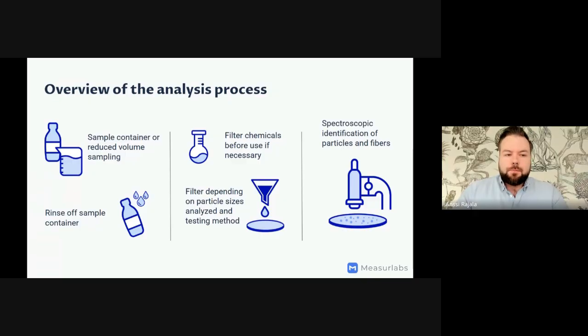Then the sample is pre-prepared, usually with digestion, especially if it's a complex matrix. And all the reagents used in this part are always first filtered also with microfilters. And then the sample is filtered on a microfilter, and the spectroscopic identification is carried out on the filter.